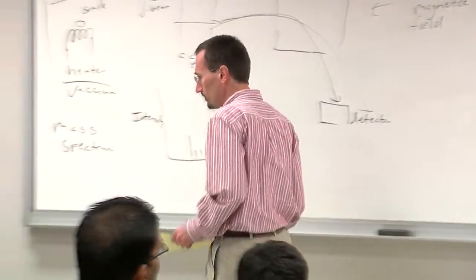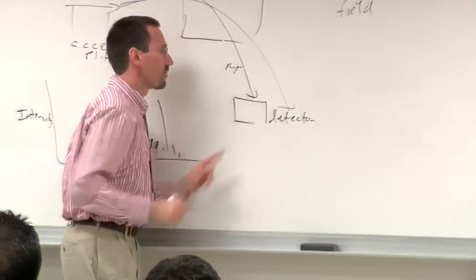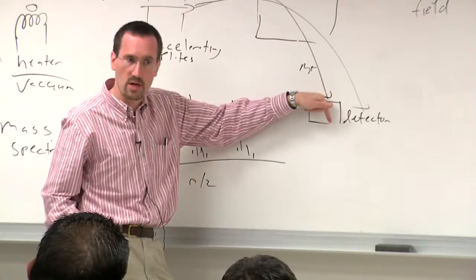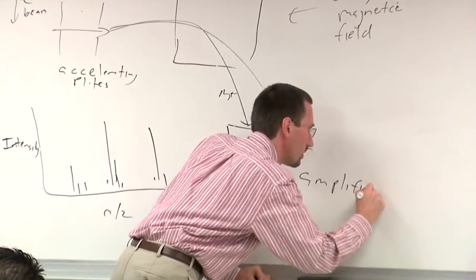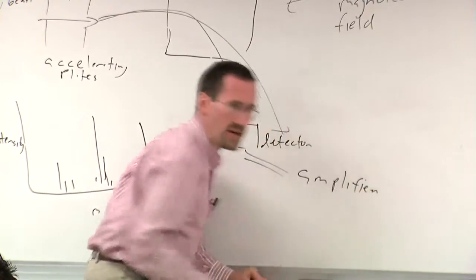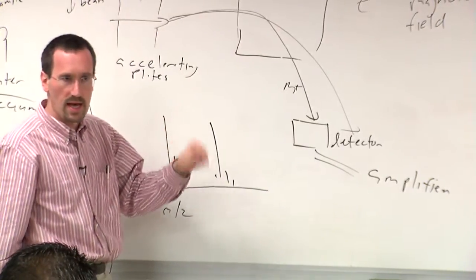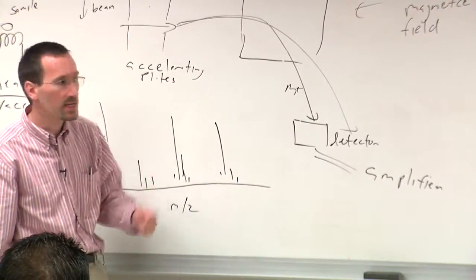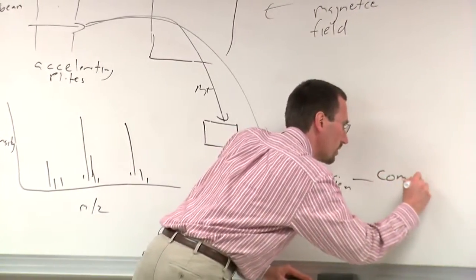James? So the detector produces a current. How does it produce the current? Well, very simple. If you have M plus, a charge, going to a detector, that means you've got electricity going in. And so you send that to an amplifier, just like a microphone in your cell phone generates a minuscule current, and then it goes to an amplifier and then gets broadcast, actually gets digitized in that case, and goes to a computer.